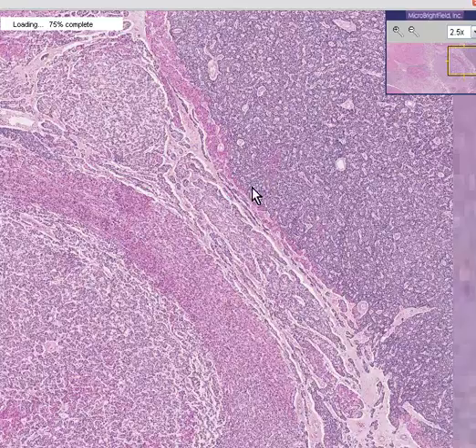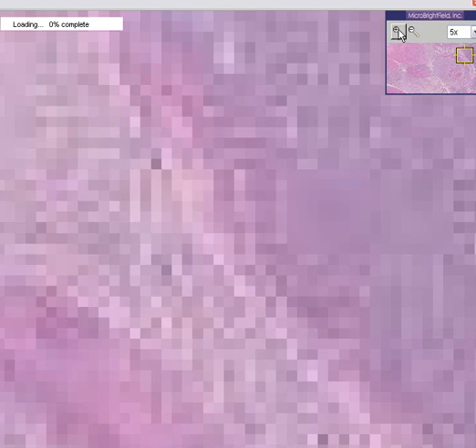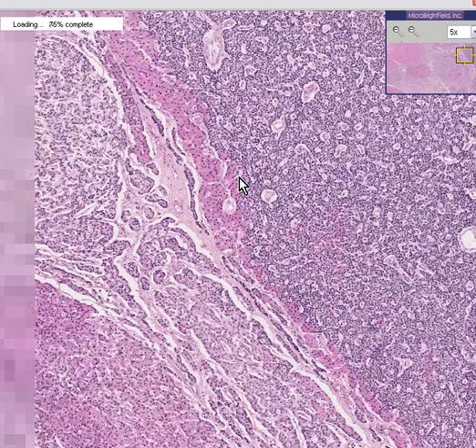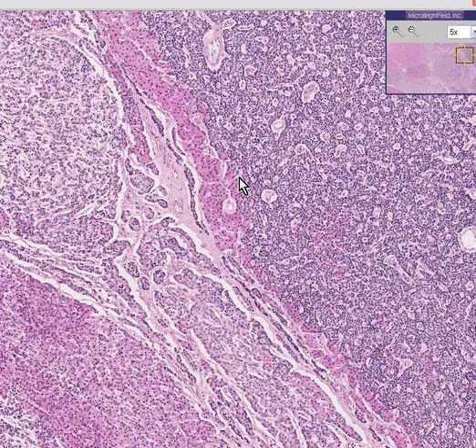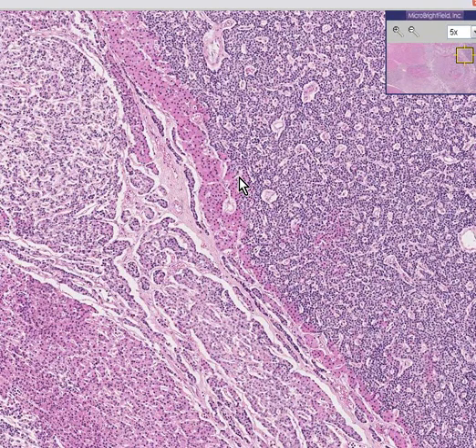Notice that this parathyroid gland has a lot of tissue. Normally, the weight of a parathyroid gland should only be about 50 milligrams — I've seen it as low as 30 or as high as 65 — about the size of half a piece of rice is the normal size and weight of a parathyroid gland.